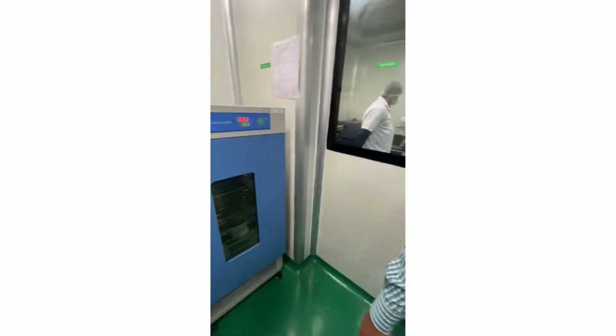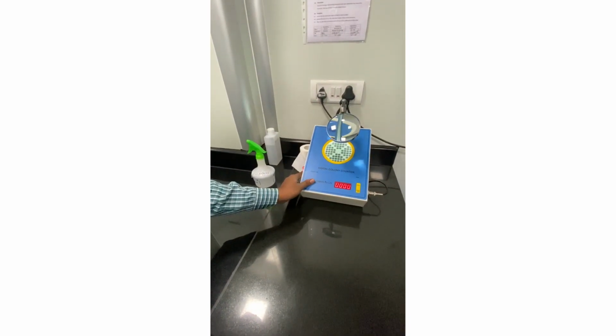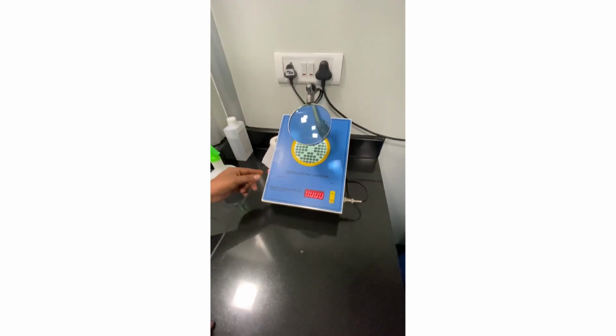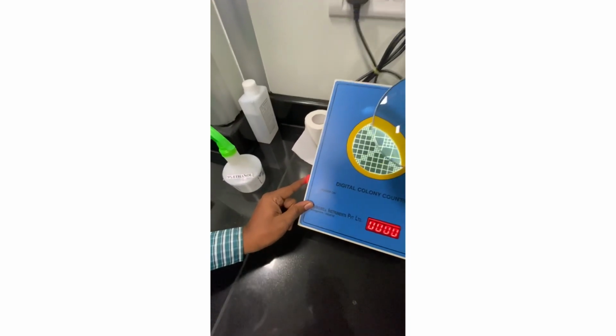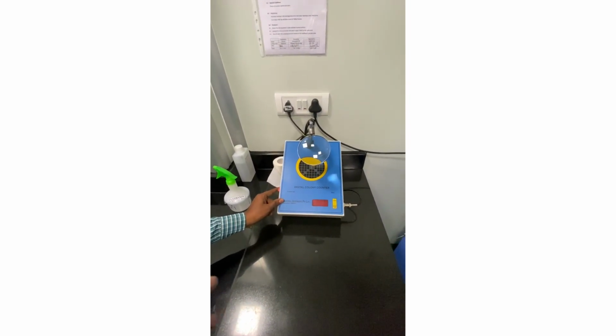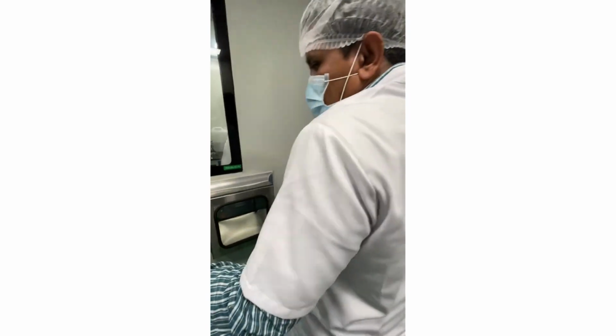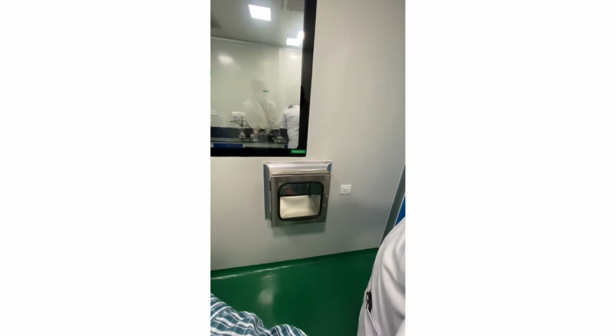After completion of this, in this equipment we are counting the colonies, how many colonies are present. This is a digital colony counter. We are keeping the plates here after completion of the incubation period, and we are counting.